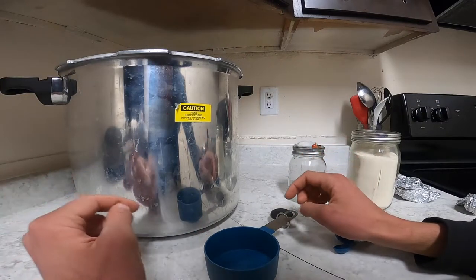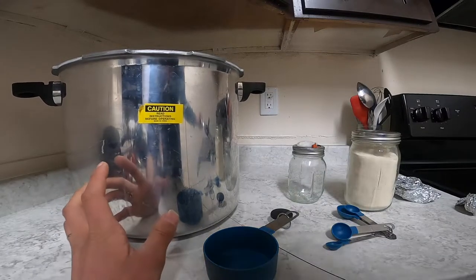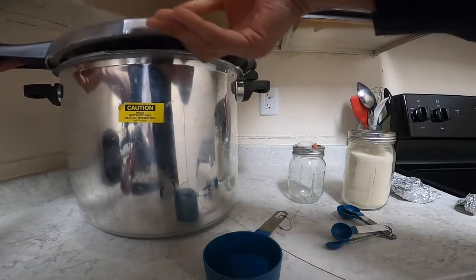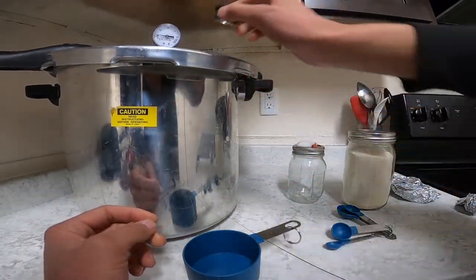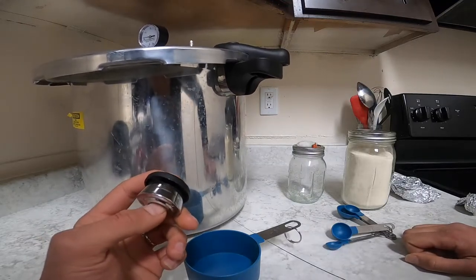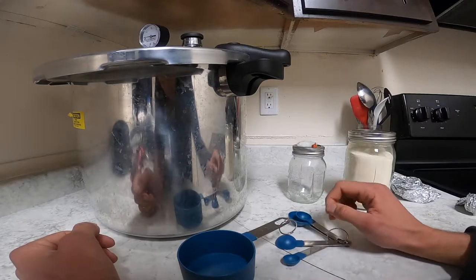Here we have everything we need to make a liquid culture. Here is our pressure canner cooker and the top for it. Make sure you get one with a gauge on top and also the topper that goes on top of the pressure valve. It's going to work a lot better with the weighted one. This is the regular one — especially if you're at high elevation like in the mountains, you'll probably need the weighted one. Here we also have some measuring spoons and something measured in milliliters.